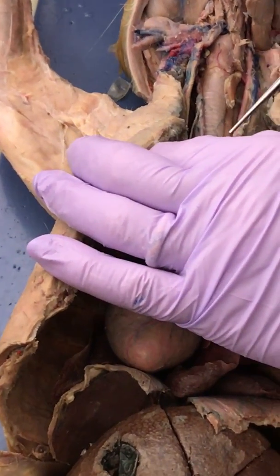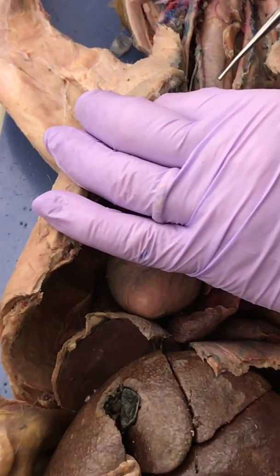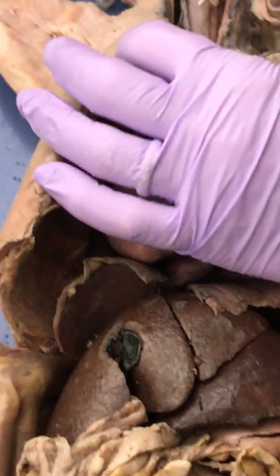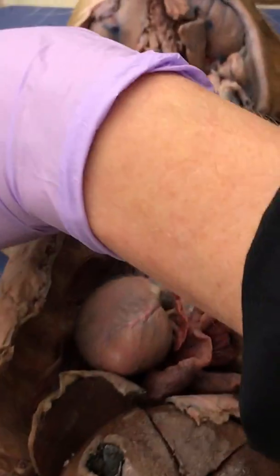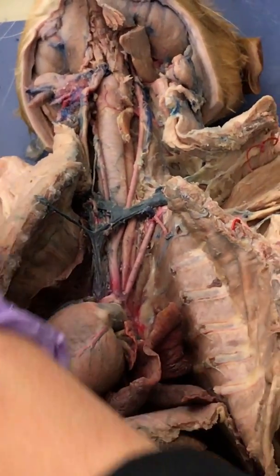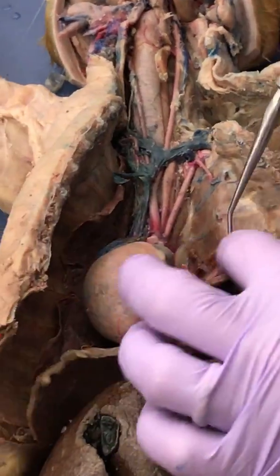Hey Chris, is your cat the one with the sternal vein that's still attached to the chest wall? Okay. Yeah. So if you look at Chris's cat and Paulina's cat, their sternal vein will still be attached right there. Okay, cool. But when we open it up, it broke. That's okay. All right. You guys know all the parts of the heart.